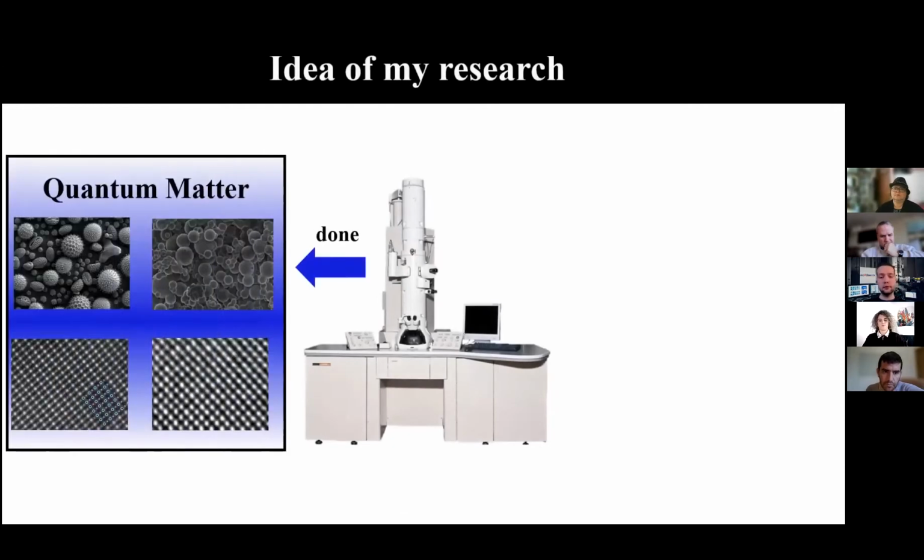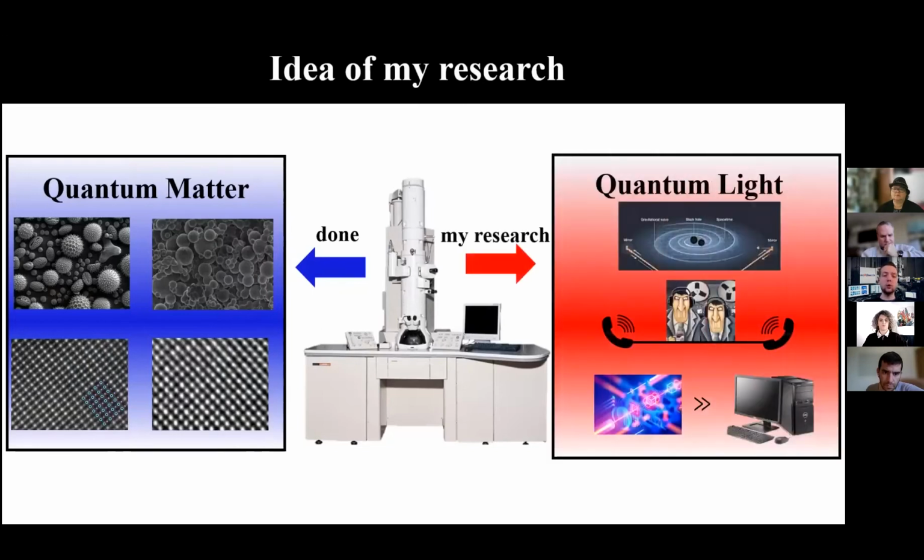What I showed before is how we can immerse ourselves in the quantum world of matter using an electron microscope. And now we're going into my research. What I will show is how to use the electron microscope to step into the world of quantum light.